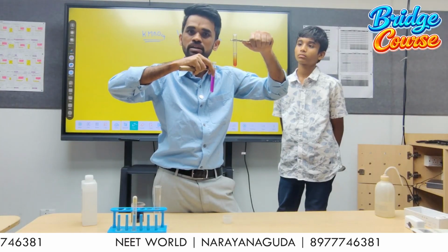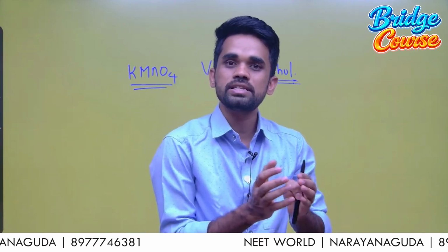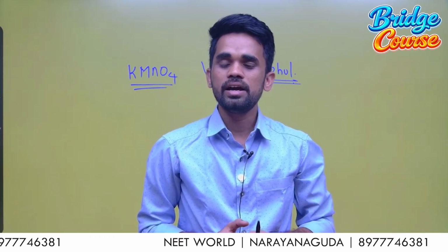Yeah, let me explain using the book. So what happens when KMnO₄ is added to alcohols? See, alcohols get oxidized to carboxylic acid and KMnO₄ gets reduced here. Let us see the reactions that are taking place here.